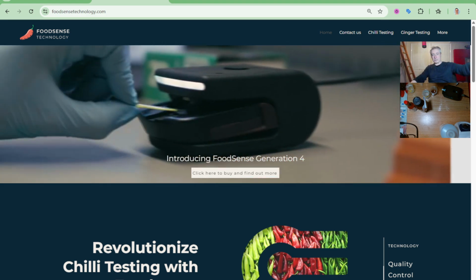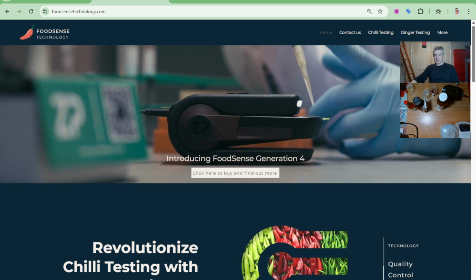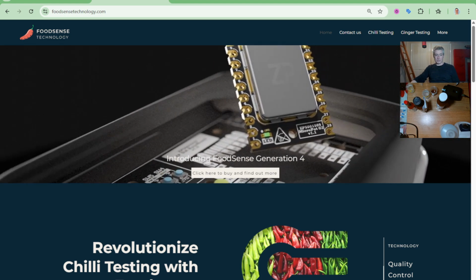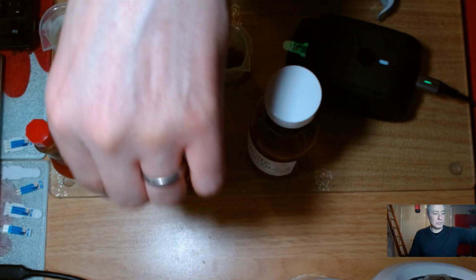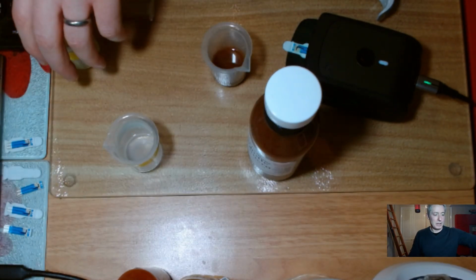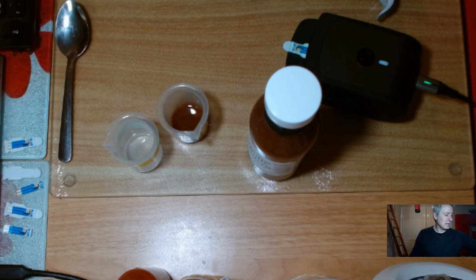But what I'm going to now do is take the Food Sense Generation 4 and measure the Scoville heat units through the amount of capsaicin that's in there, and we're going to measure the Scoville heat units for this particular product. Now I've got a few things going on in front of me. It's quite busy actually, so I'll take out the bottles that I'm not going to immediately test, and I'll just focus in on what we have got here. I'll do a little organoleptic test at the end.